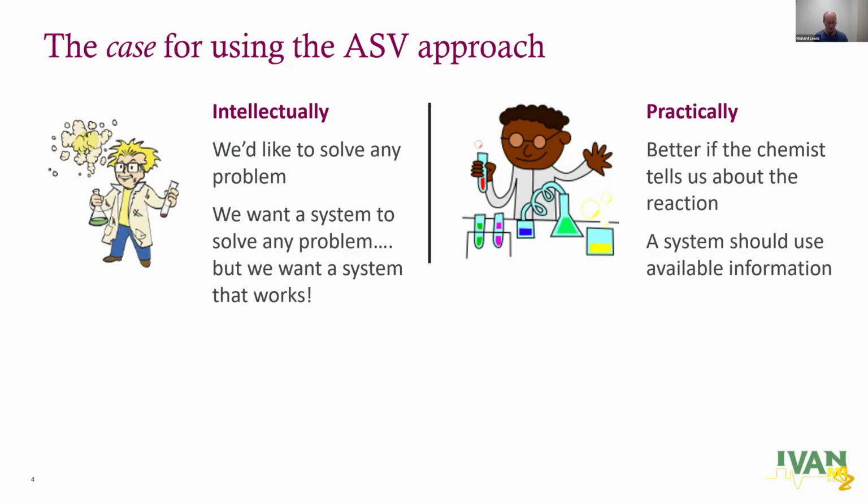We're going to need to collect loads of data, and we might not even be able to give a definitive structure at the end. On the other hand, there's another situation where a chemist has done a defined reaction and got several products out of it, and they ask you which of these regioisomers or stereoisomers is which. As an NMR spectroscopist, we'd probably be quite happy tackling that. We say, oh, that should be pretty straightforward. I can probably give you an answer pretty quickly and on a limited set of data.